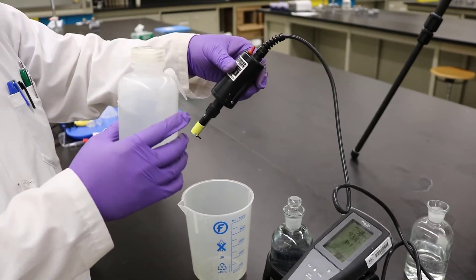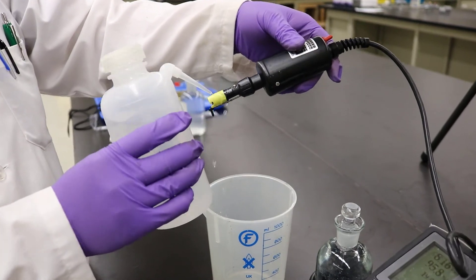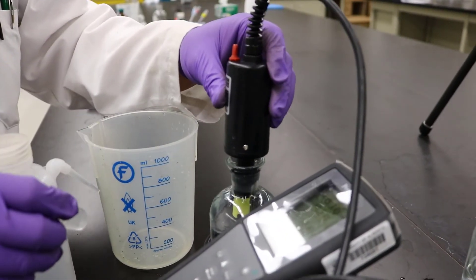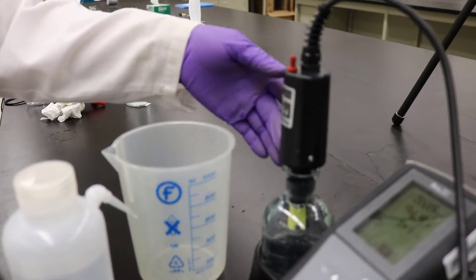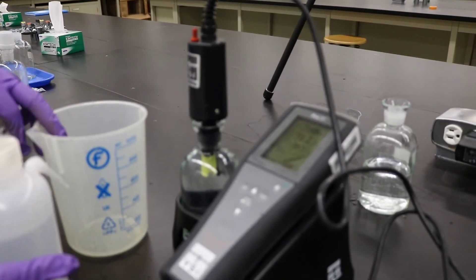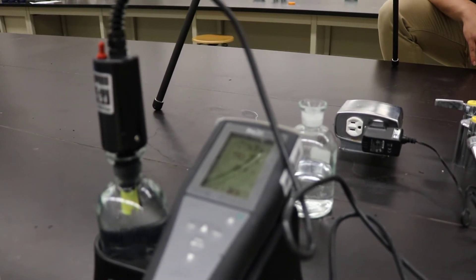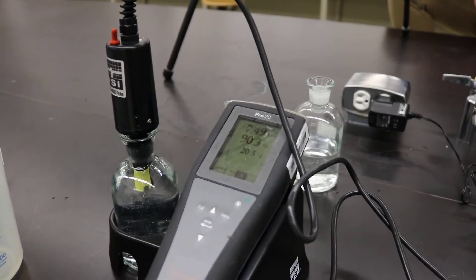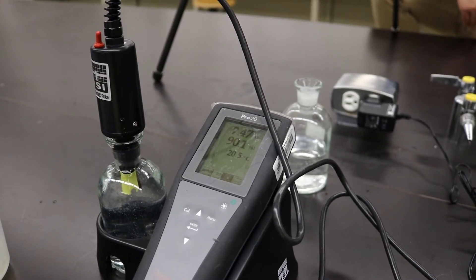Rinse the bottom membrane part of the DO meter with deionized or DI water. Open the sample bottle stopper and put in the DO sensor quickly. Turn on the stir by switching the red button. Wait about 5 seconds and read the number. The DO reading may not be stable, so just take the reading at 5 seconds. Finally, stop the stirrer, take out the DO sensor and rinse it, then put it back in the DO sensor storage bottle.